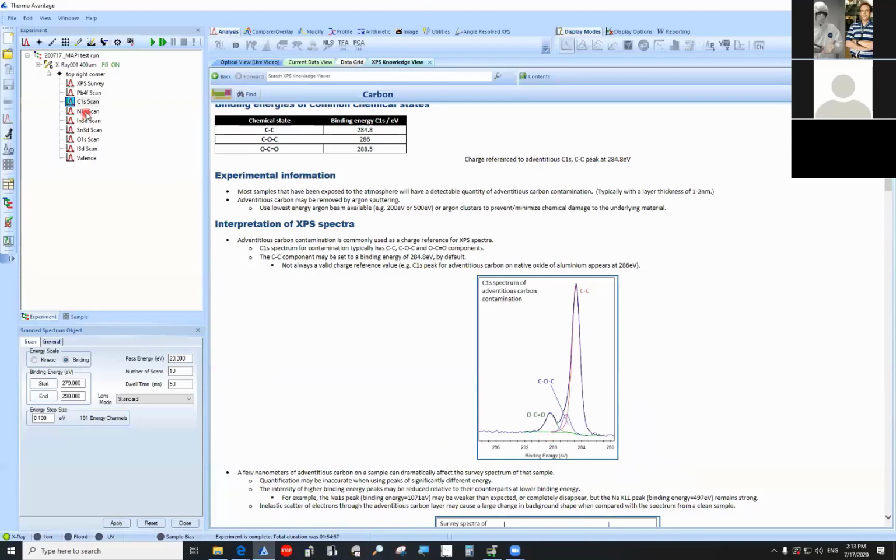Okay, moving on to nitrogen, same thing. Okay, here, indium. And if you guys have any specific knowledge, or if in the standard data that I sent there is a different scan condition that you prefer to stick with, please let me know.